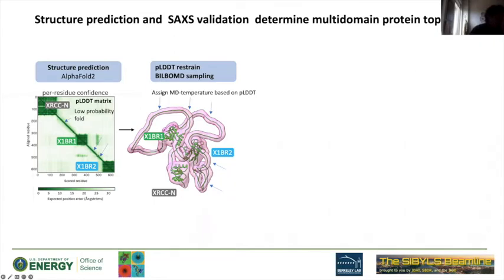There are some non-folded regions, but most likely flexible. But still, the AlphaFold comes up with a very compact topology between those 3 domains. So what we are doing, you can use the MultiFoXS web app and just add those residues as linkers, or you can also use the BILBOMD that is part of our web app. You can just look at it right now.